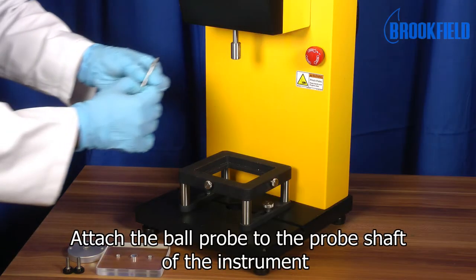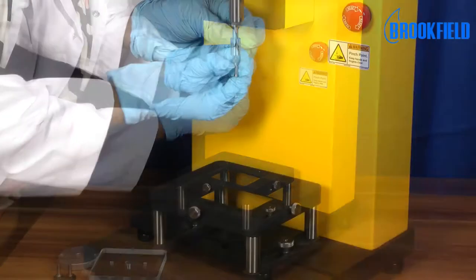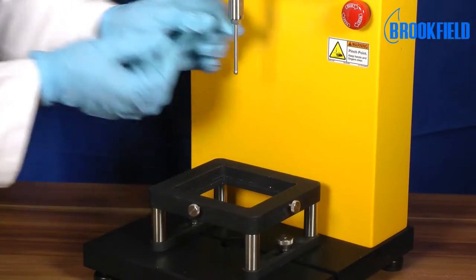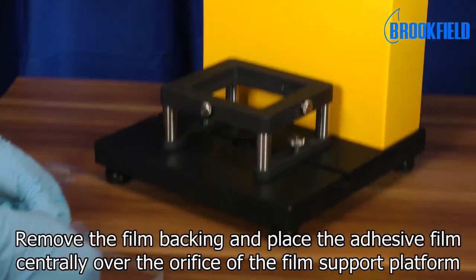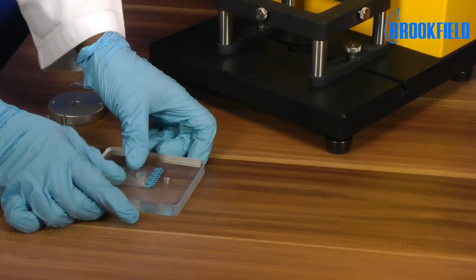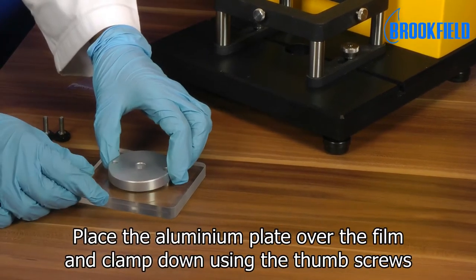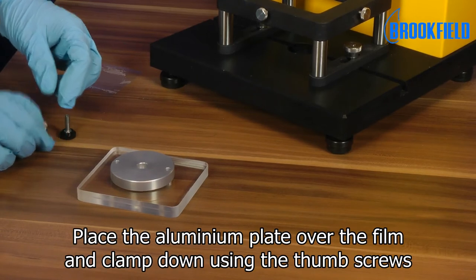To set up the test, attach the ball probe to the probe shaft of the instrument. Remove the backing of the film and place the adhesive film centrally over the orifice of the film support platform. Place the aluminum plate over the film and then clamp the film into position using the thumb screws.